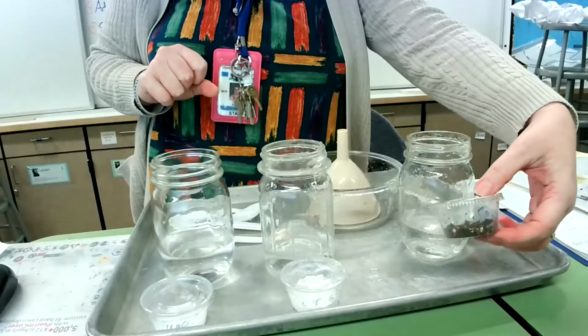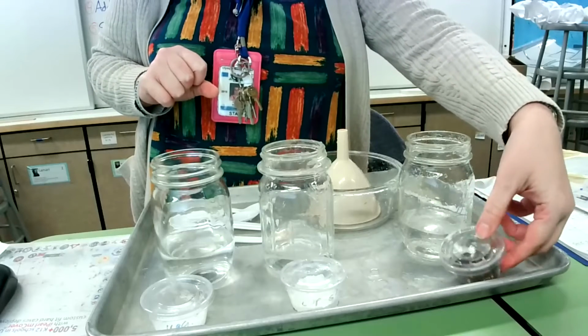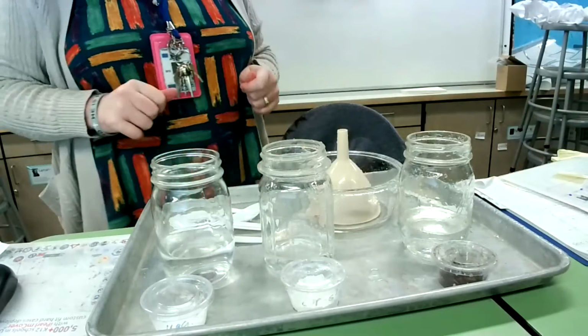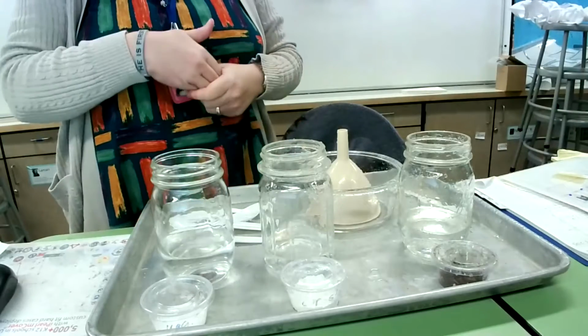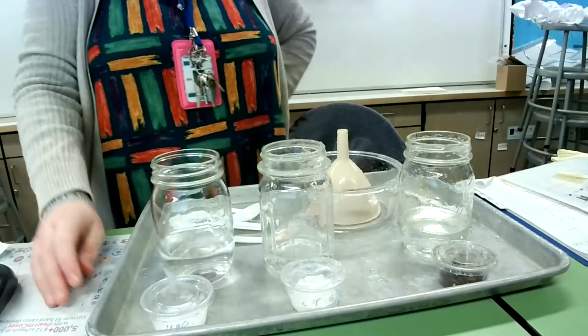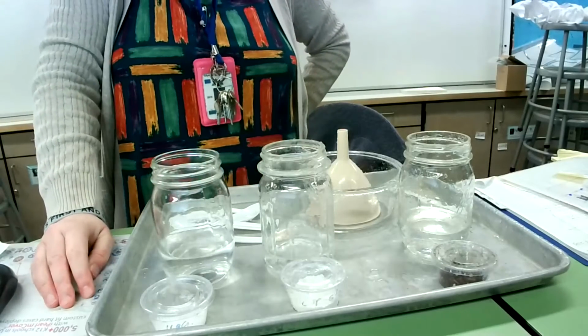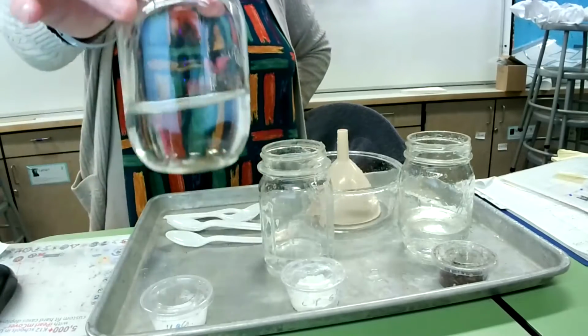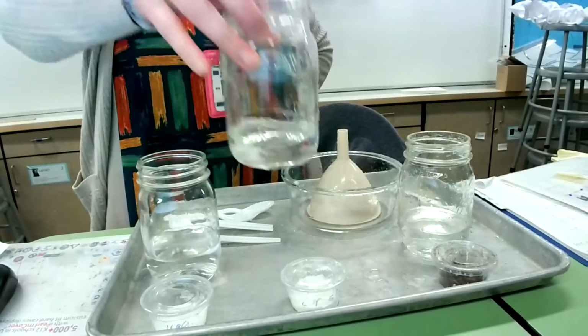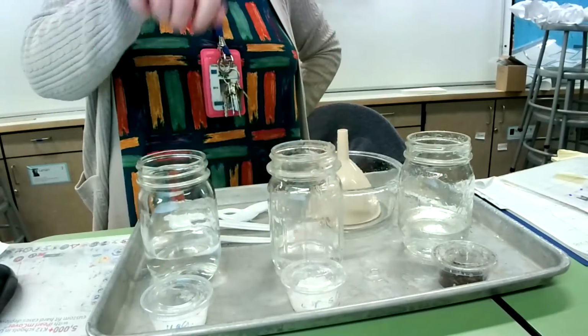So there are some sandy particles in there. There's some dirt. There's some bark. There's some little rocks in there. It's just kind of a mixed soil. So what I'm going to be doing is spooning them into each jar. I am going to be stirring, and we're going to see if these substances actually dissolve in water. So I have just clear water in the jars, just tap water, okay? And we're going to stir.